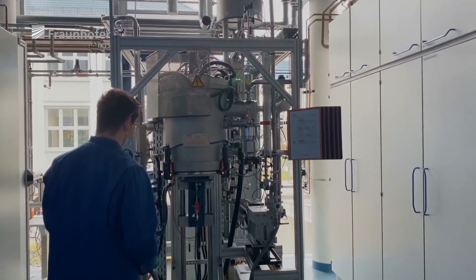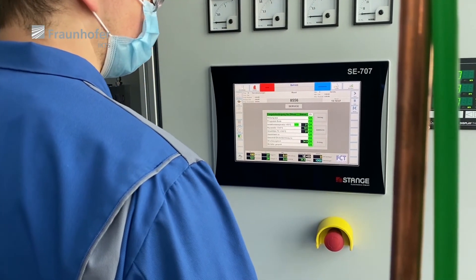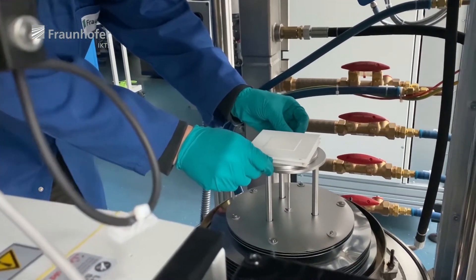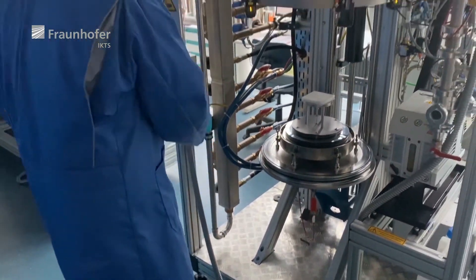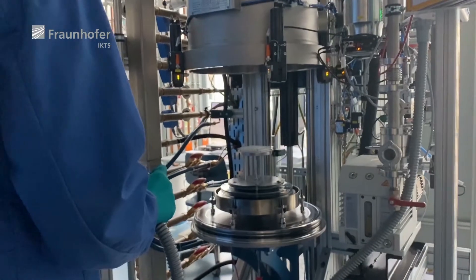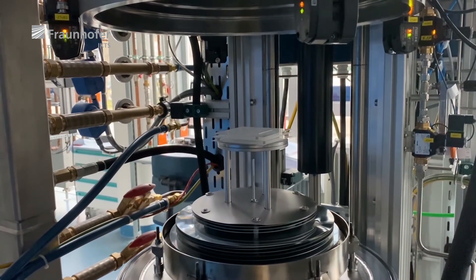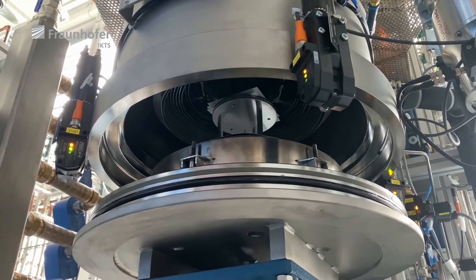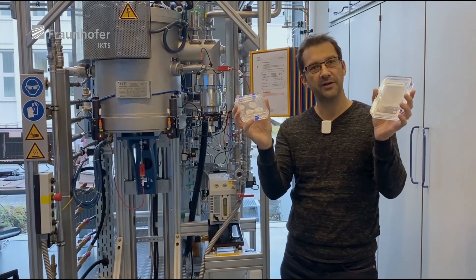Because our battery technology requires very dense sintered substrates, the sintering process is usually performed in high vacuum. The cast tapes are transferred onto very flat ceramic substrates and then placed onto the charging carrier of the furnace. Finally, after sintering of the green tapes, we receive from the furnace the final solid electrolyte substrates, which are now ready for electrochemical characterization.